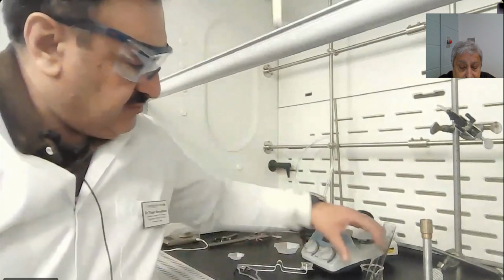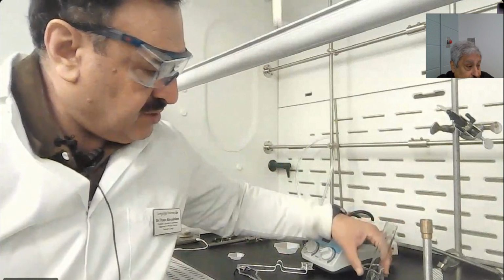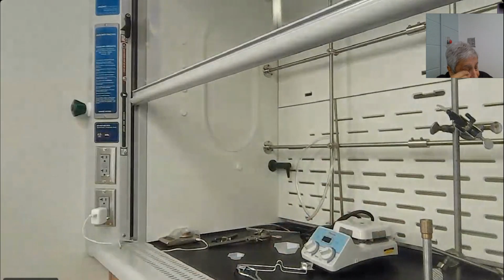Okay, so take your beaker with your test tube. See that? We'll not touch it with your finger. We'll touch it with tissues, because then you have the fingerprinting and impurities from your finger. Always with the tissues. Now, he has to weigh what? The manganese oxide, the dry one, without any moisture inside. And then we'll weigh the mixture, 2 grams. Put the mixture inside with the manganese oxide, the catalyst.